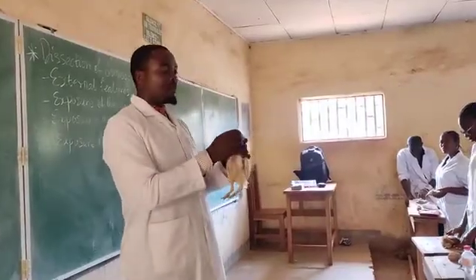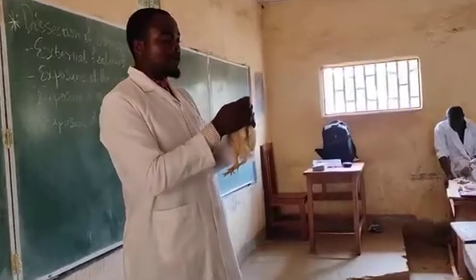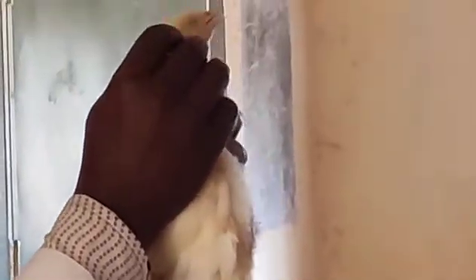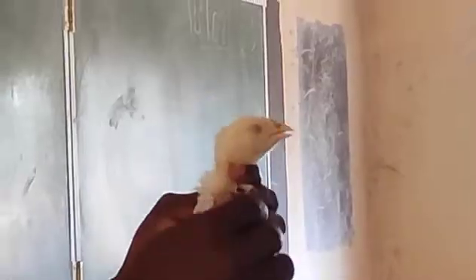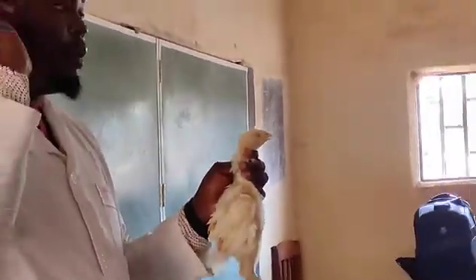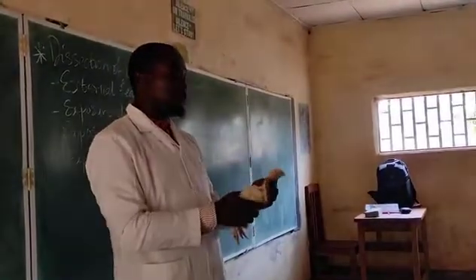Now we have a pair of eyes. The eyes are covered by an upper and a lower eyelid, which are very tiny. And below the eyelid, we have the nictitating membrane. It can move that membrane from time to time to moisten the eye and also to clean dirt. If you look just behind the eyes, you see that we have the eardrum. It has just the eardrum without the external ear. The eardrum is used to receive sound waves from the environment.